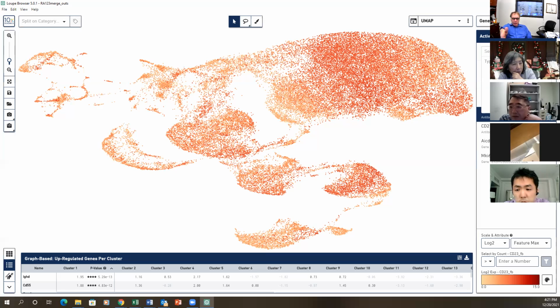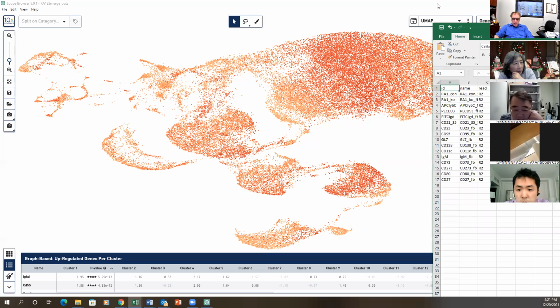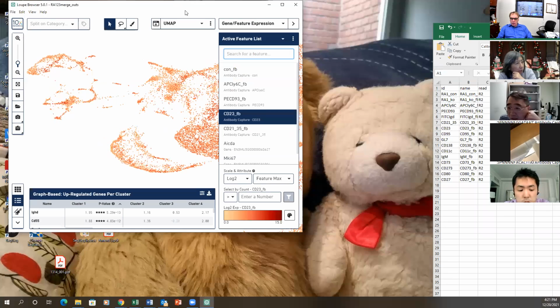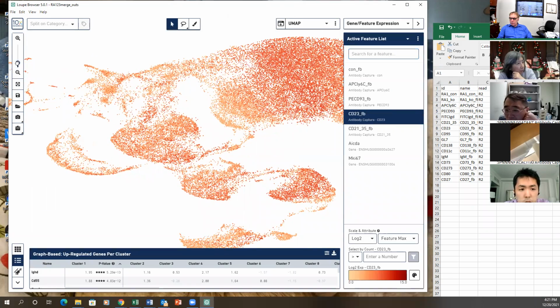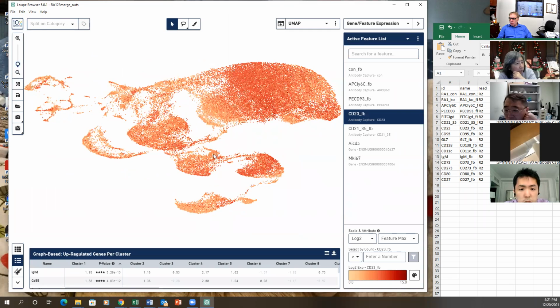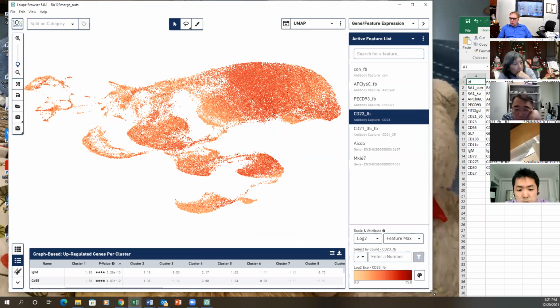Where's the list of antibodies again? Yeah, these are the few ones. Oh, I got the list of antibodies. Oh yes, here. I have the list of antibodies. Right. Let me look at this a second. So if you do, oh no, okay.